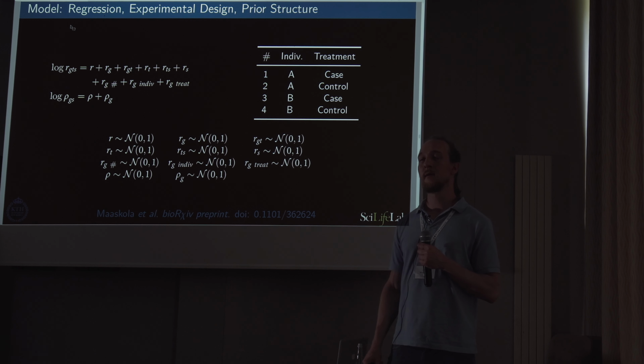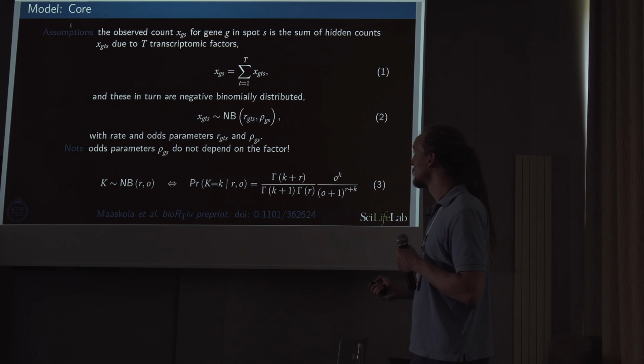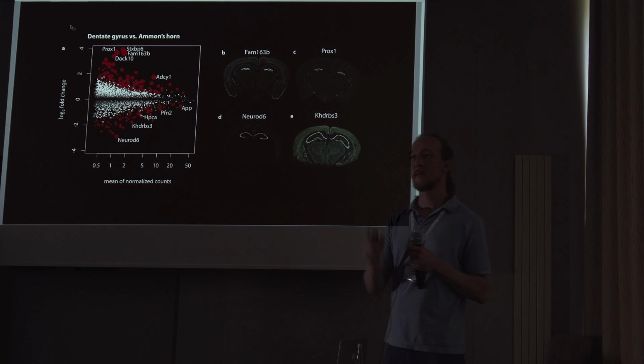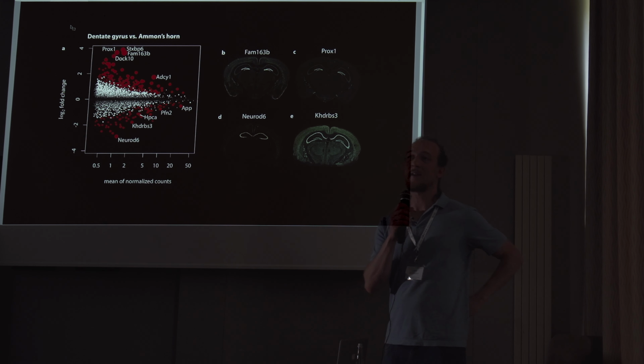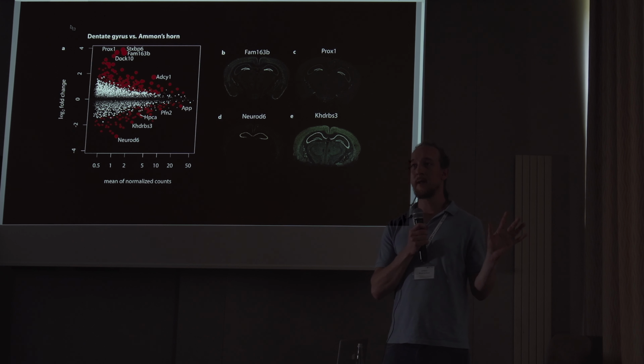Okay, and then in that case, when you go later on to look at the actual differential expression, do you simply get those from the regression model? Yeah, good that you ask, because really the DGE part here is fully reliant on DE-seq.